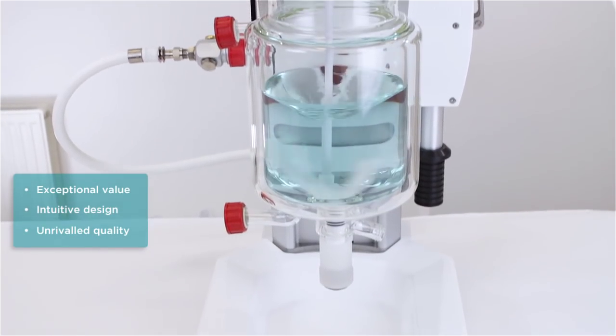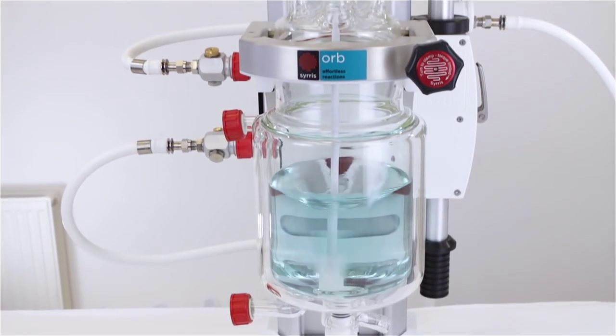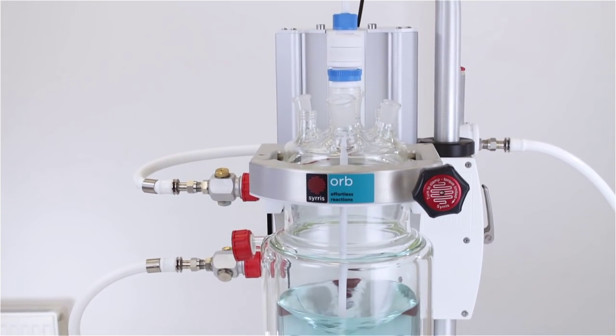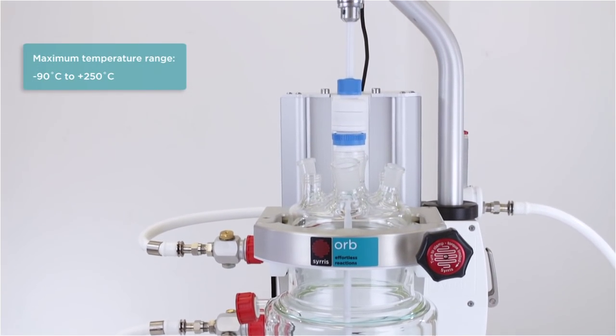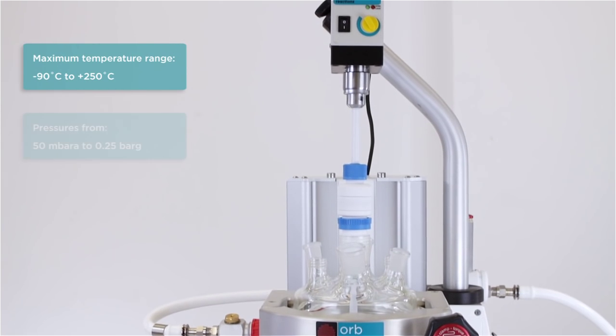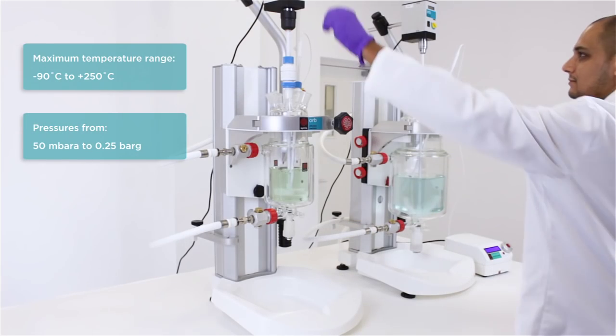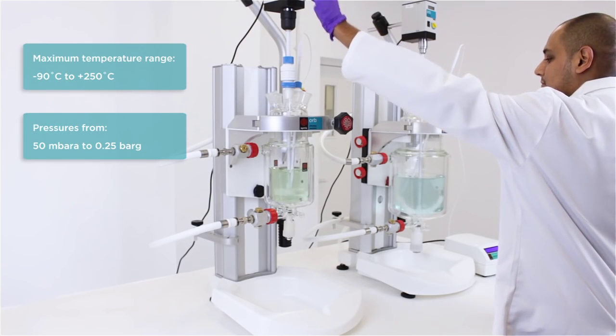Designed by chemists, Orb is a high-quality, user-friendly and reliable solution for batch reactions, with a maximum temperature range of minus 90 degrees C to plus 250 degrees C and pressures from 50 millibar to 0.25 bar.